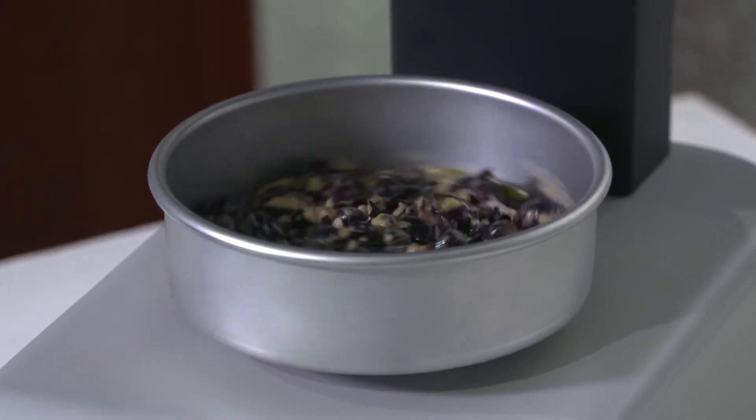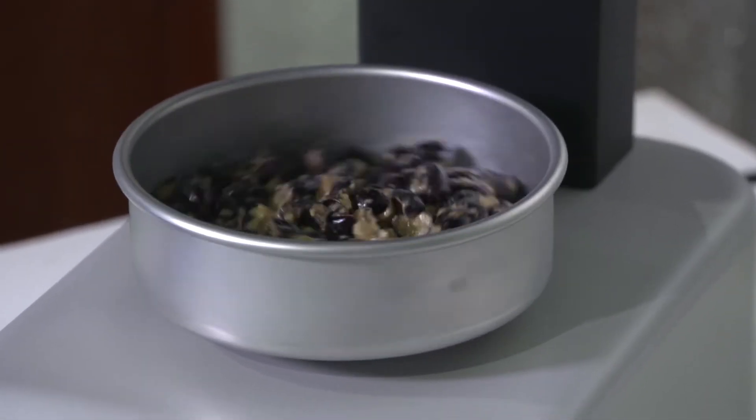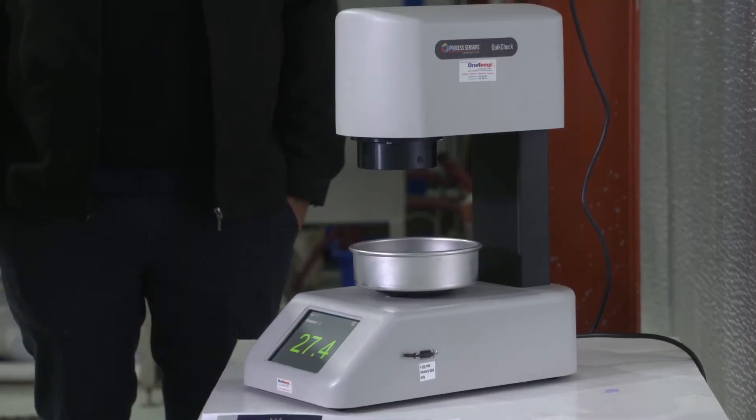So away it goes, it'll start spinning and there you go, it gives you a reading. Now those readings can be saved. You can save 100 different readings, ideal for different varieties of olives. So you can compare with your previous yields.